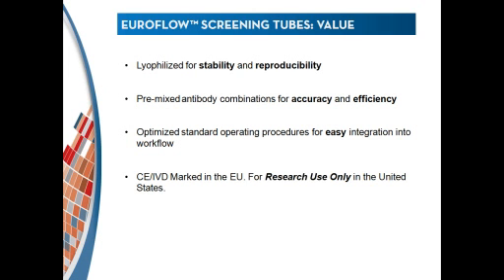All the screening tubes are optimized for use with the EuroFlow protocols for easy integration in the workflow, and in Europe they are CE-IVD marked, but in the United States for now they are research use only. It doesn't matter, because, as the name says, screening tubes are for doing the screening, not for giving us a final diagnosis, so you can use them without any problem, even being RUO.